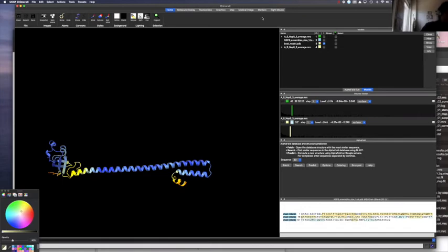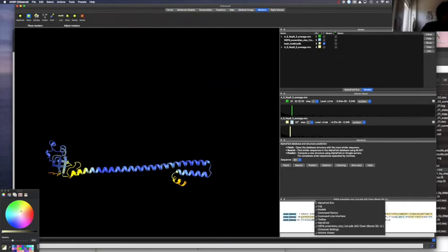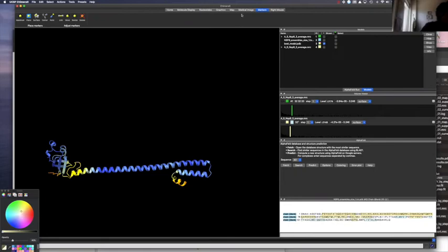They make it so easy that this Google interface, or the Google Colab, is directly plugged into Chimera. So if you go here, okay, I'm going here. Yes, when you have a sequence uploaded, I already have it open.